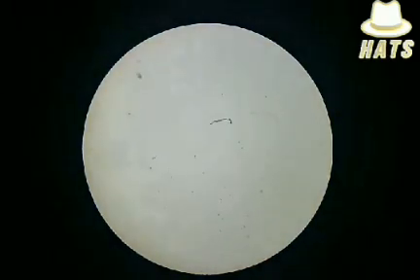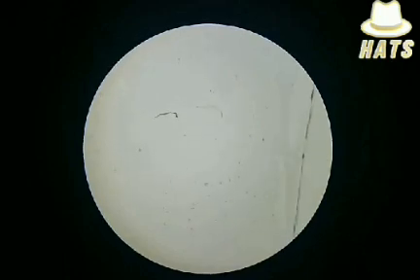Let's see these fibers. There are fibers there. Let's take a look at this too. This fiber at 100 times, at 400 times.